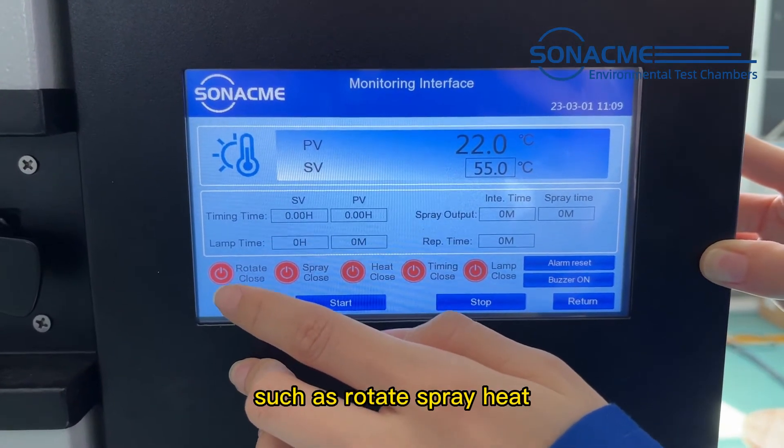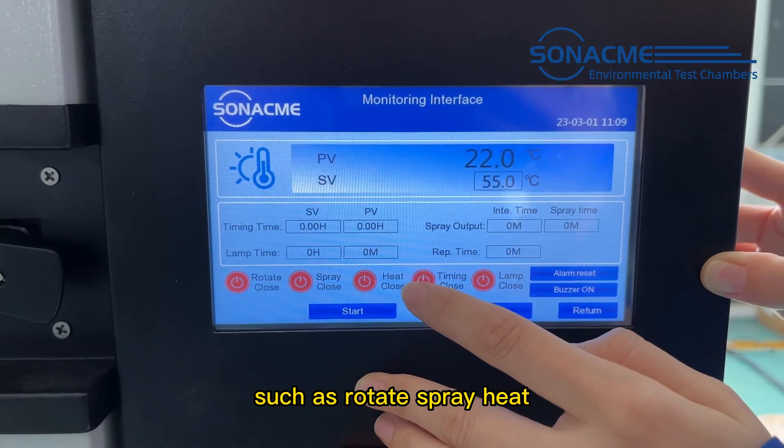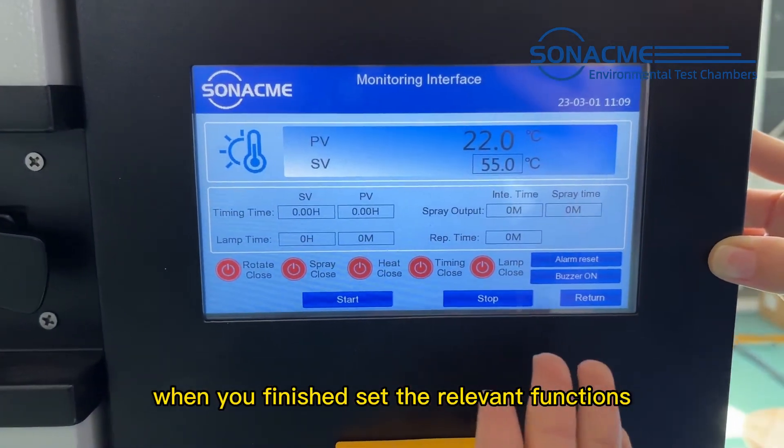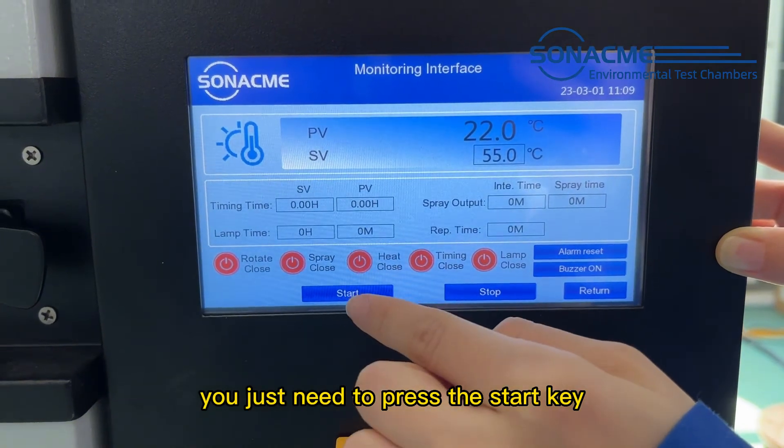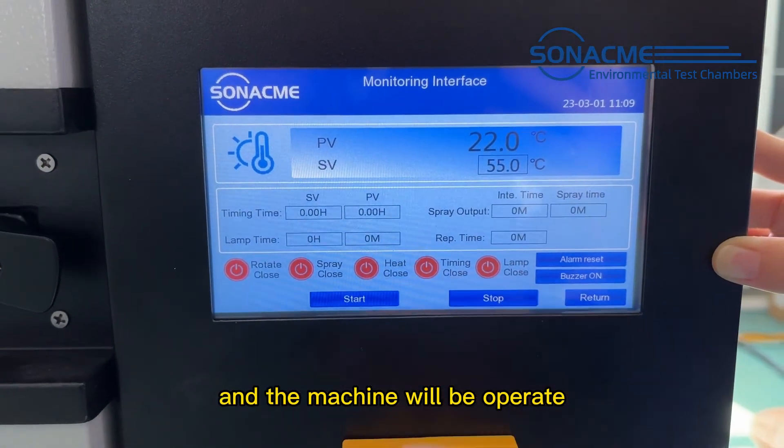The running functions include options such as rotate, spray, and heat. When you have set the running function, you just need to press the start key and the machine will operate.